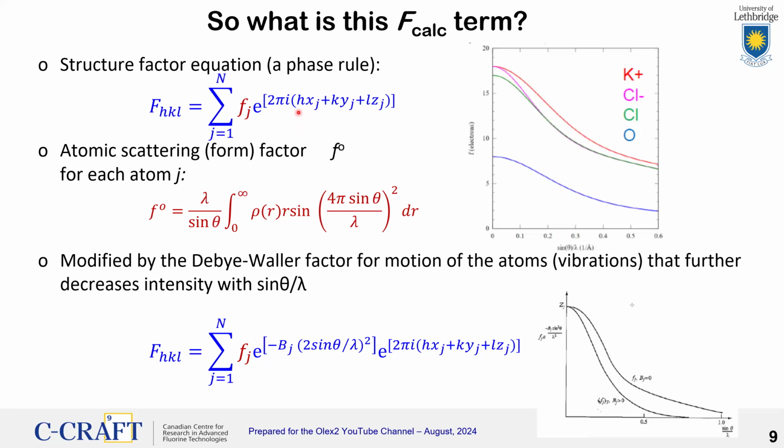And modified by the geometrical parameters h, k, and l, so that we can measure the impact for every possible kind of diffraction event. Every individual peak on that detector is treated in this summation.